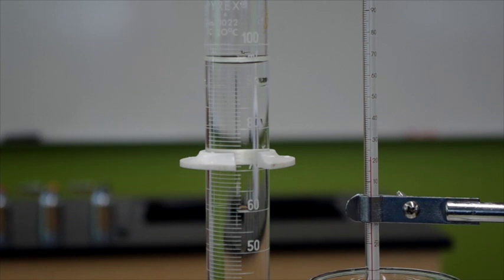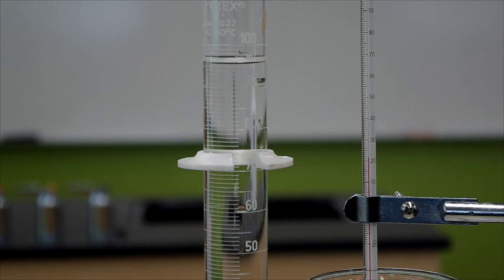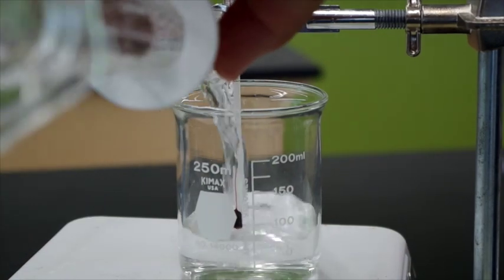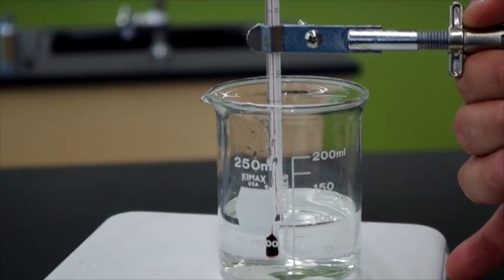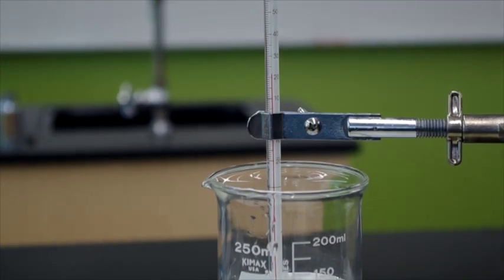Okay, so we have a graduated cylinder filled with approximately 100 milliliters of water. And if you look at the meniscus, it's 95.5 milliliters of water. Now, we dump the water into the beaker. We adjust our temperature rod so that it's just off the bottom. And we give our water a chance to settle.